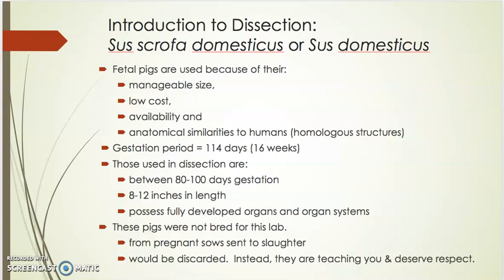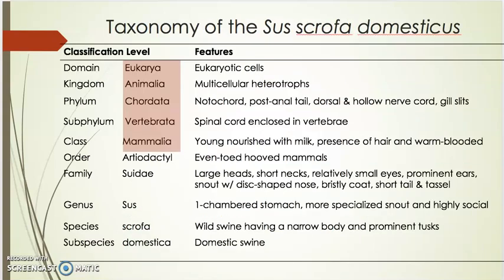During Bio 1, you'll do a virtual dissection, and during Bio 2, you'll do a live dissection. Not a live dissection, but you will do a dissection at CCM with a fetal pig. This one will be virtual instead to get you ready for it.